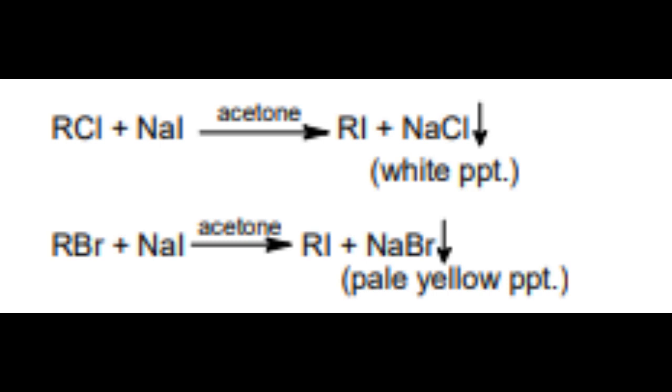A positive test for unsaturation is one in which the color of the bromine is discharged without the evolution of hydrogen bromide. Discharge of the color of bromine accompanied by evolution of hydrogen bromide indicates that substitution has occurred. Many aromatic compounds, which have electron-donating groups present on the ring, undergo this type of reaction. Some typical compounds are phenols and amines. HBr is evolved in a substitution reaction and no HBr is obtained if addition of bromine takes place.